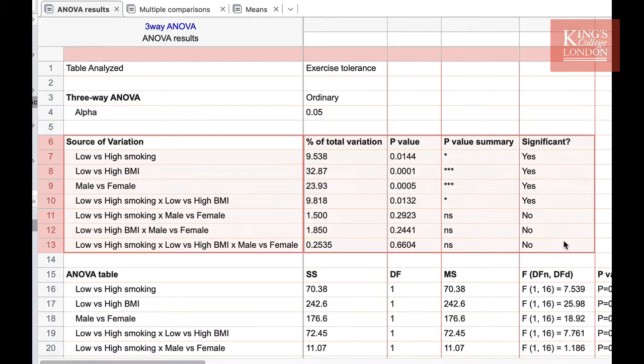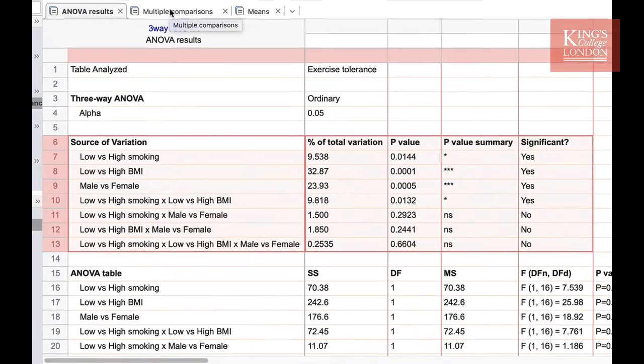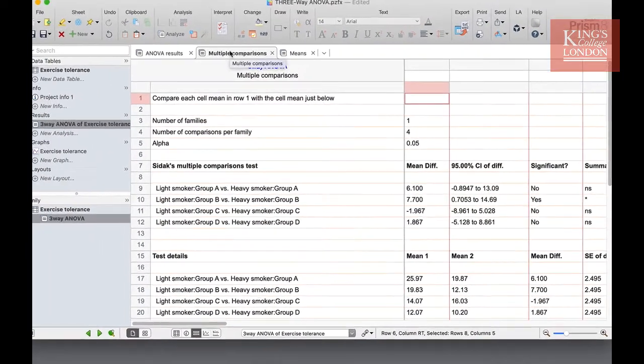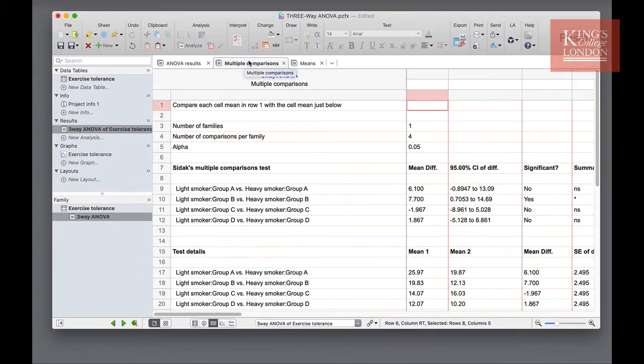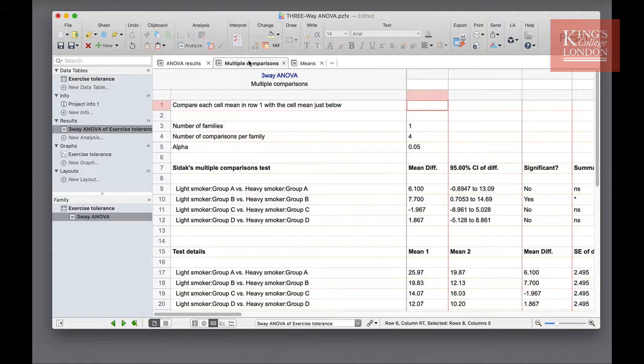Once you are satisfied with this result, you can move on to the multiple comparisons window, which is the second tab in your results section. The multiple comparisons table will report the data as selected in the multiple comparisons option box when you chose which analysis to carry out.